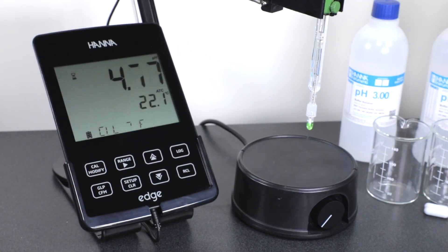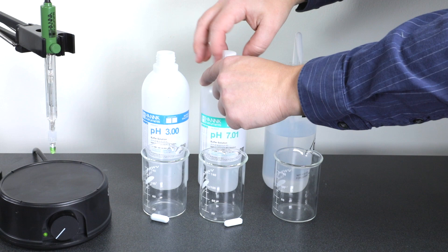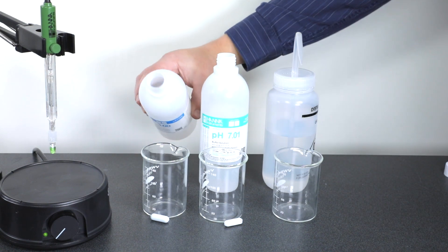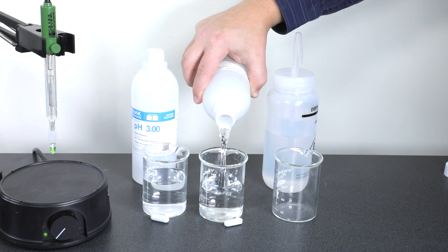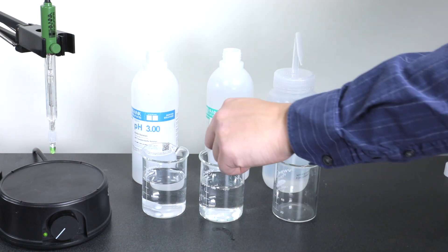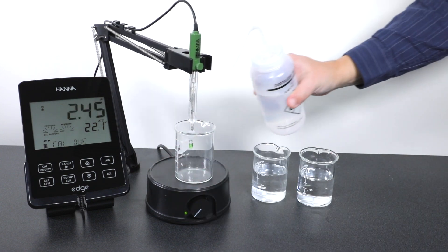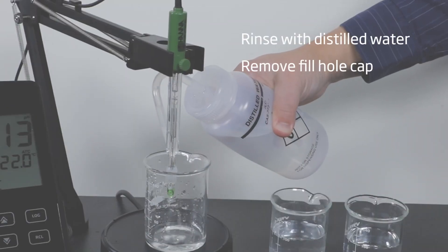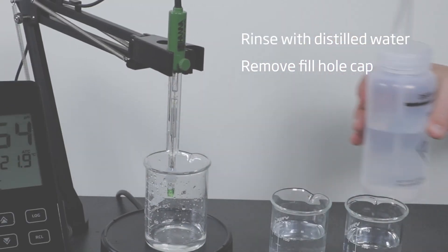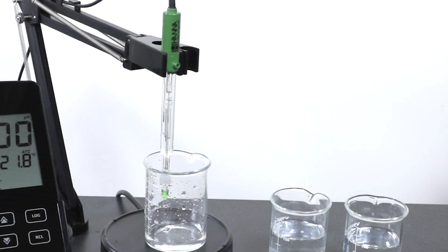The screen will show you that your calibration data has been cleared. Before you begin calibration, get your magnetic stirrer into place and pour your pH 3 and pH 7.01 buffers into clean beakers. Place a stir bar in each beaker and have an empty beaker handy for rinsing your electrode. Then rinse your electrode with distilled water to remove any salt residue from the storage buffer solution. To calibrate your Edge, enter calibration mode — it will ask you to use pH 7.01 buffer first.